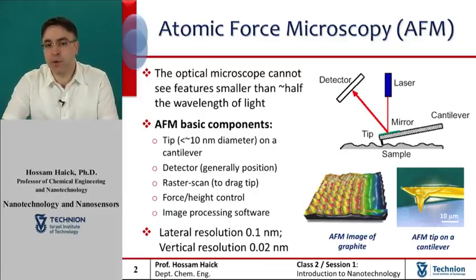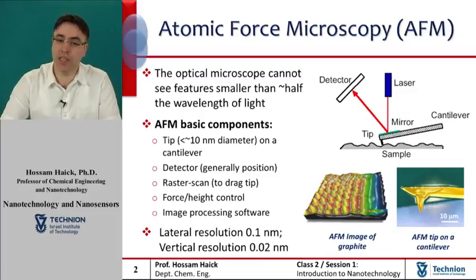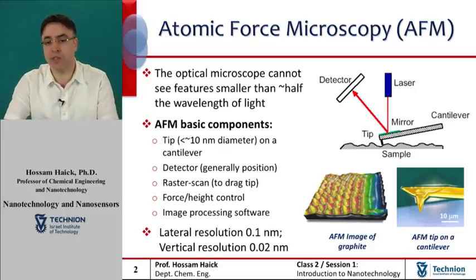In alternative modes, a tripod configuration of three piezoelectric crystals may be employed, with each responsible for scanning in the X, Y, and Z directions. In newer designs, the tip is mounted on a vertical piezo scanner, while the sample is scanned in X and Y using another piezo block.